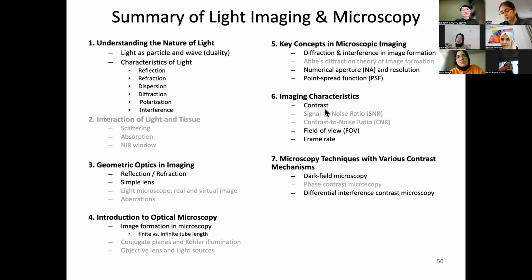And I discussed contrast, field of view, and frame rate. And I actually skimmed through a little bit of these microscopy techniques. The gray ones I didn't cover, but this is the basics.